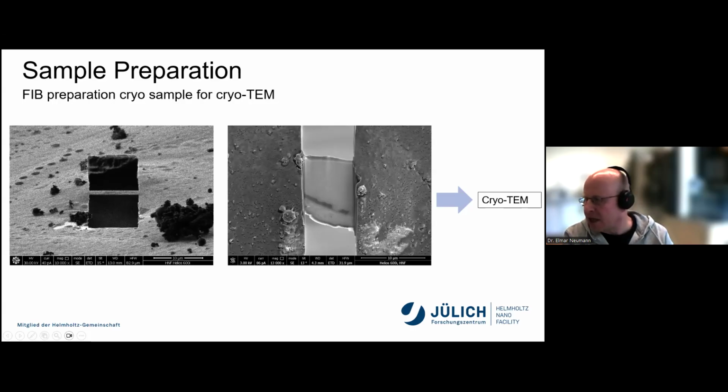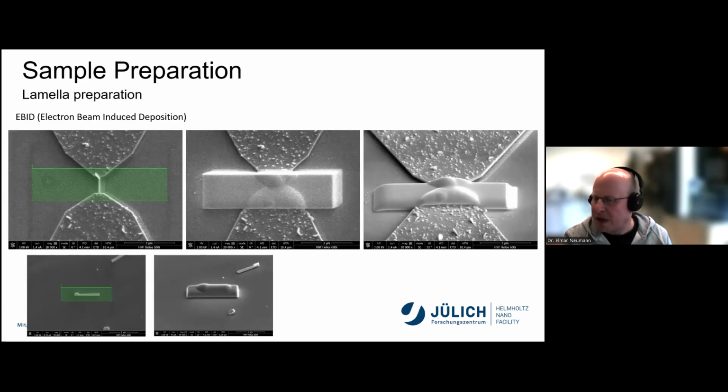And this goes directly into a cryo-TEM where they, for example, record tilt series of your respective molecules somewhere here inside that you may guess. And then again, with lots of math, they can reconstruct these molecules, ribosomes for example, afterwards on the basis of such images. Yeah, the regular room temperature TEM lamella preparation goes as follows.